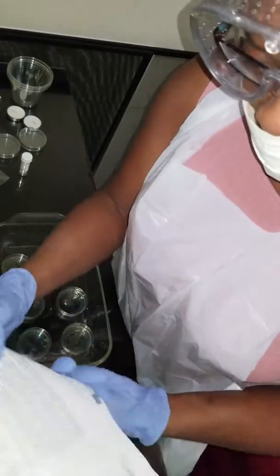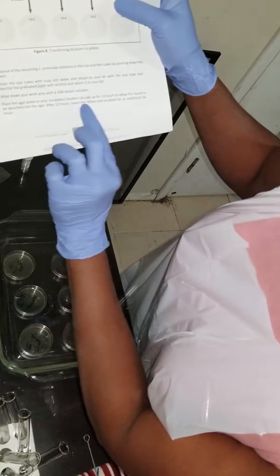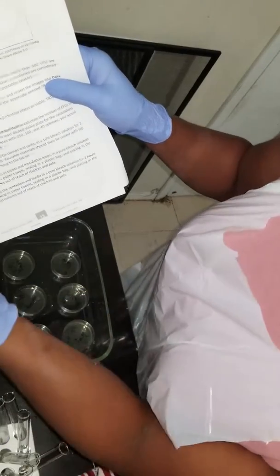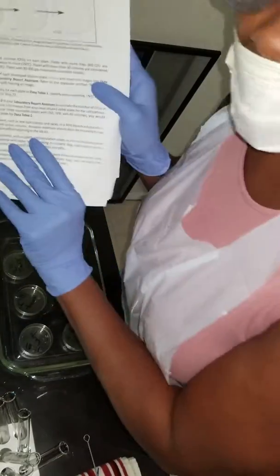The calculations will be done later. It says here in my experiment, wait 12 hours, then invert the dishes to incubate for an additional 36 hours. Like I said, it's 48 hours in total. And then I am going to take pictures of the solution, count the colonies, and present this in my lab.